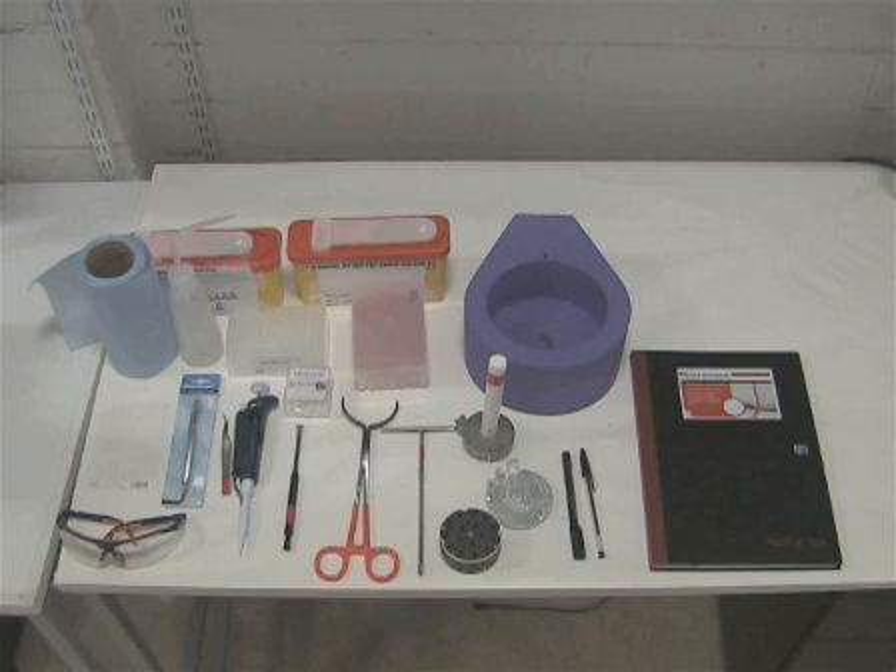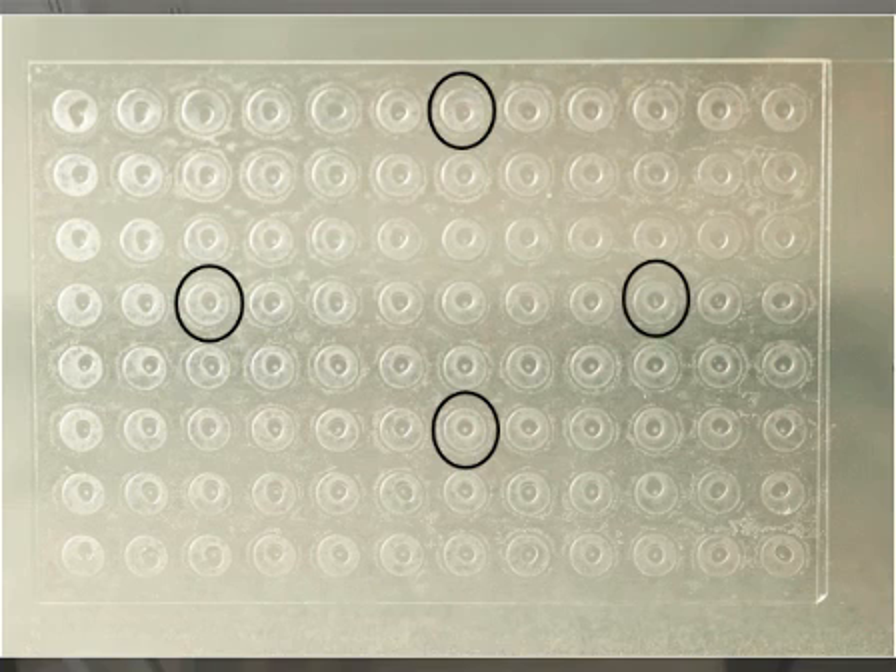The materials and equipment needed to harvest and cryocool crystals grown in-meso are shown here. They include a laboratory notebook in which to record information on crystals and harvesting details for future reference, safety goggles, glass and metal waste containers, and the glass sandwich crystallization plate from which crystals will be harvested.